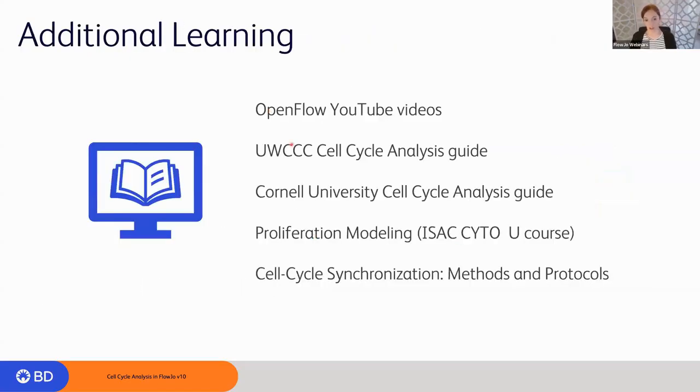So, as promised, I'll direct you here to some additional learning resources on these topics. We're going to move on to the software now and talk about the analysis component. But I think it's worth mentioning there's a lot of information out there on the web if you are looking to build up your cell cycle analysis assay in your laboratory or optimize an otherwise problematic assay.